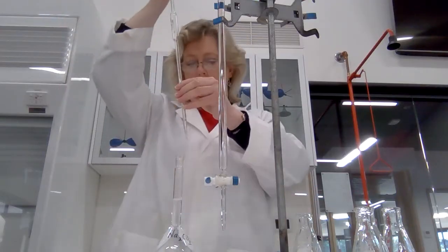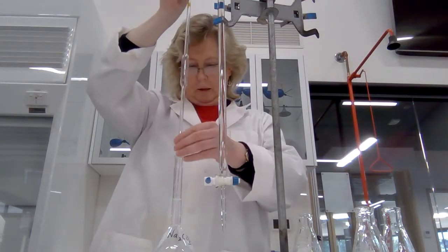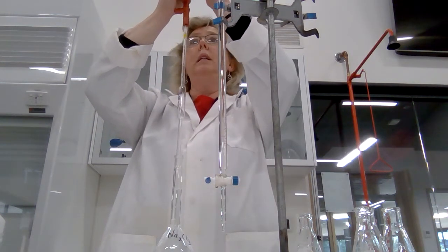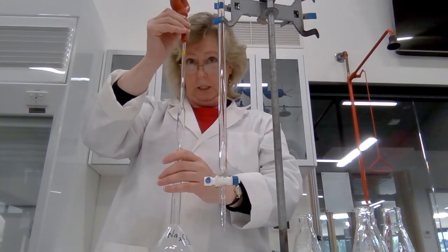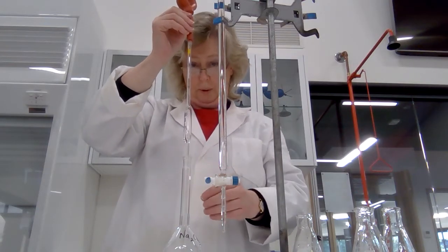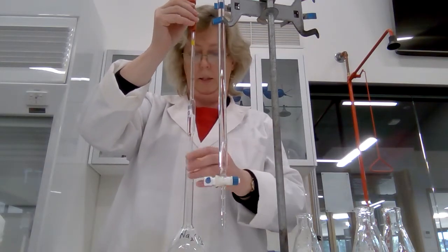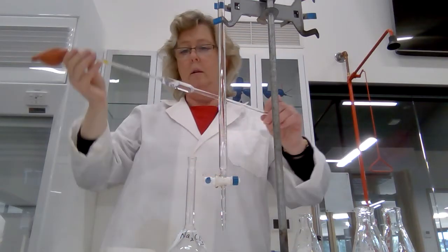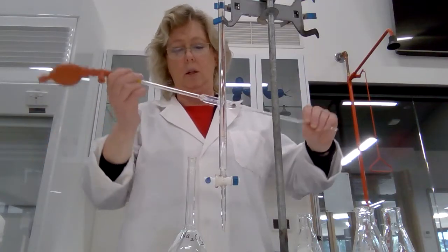The first thing I've got to do is rinse the pipette. I put the pipette down into the solution and I'm going to use the pipette filler — you can see this orange pipette filler at the top — to draw up some solution. I need to rinse the pipette, basically coating the inside with my solution.